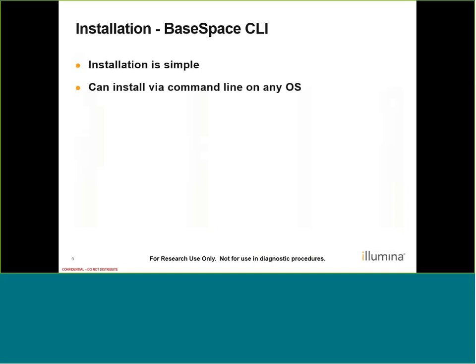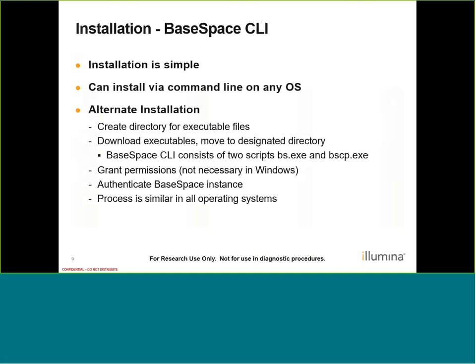If you do not have one of these packages available or pre-installed, we do have an alternative installation method. In this method, we would create our directory for our CLI executable files, then download the executables and move those files to the designated directory. BaseSpace CLI consists of two scripts: BS and BSCP. Most functionality is accomplished with the BS script, but having BSCP is also helpful. Once we have our scripts in our designated directory, we'll need to grant permissions — this is your standard chmod type of step. Note that this is not actually necessary to do in Windows.